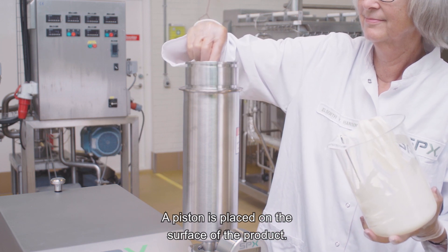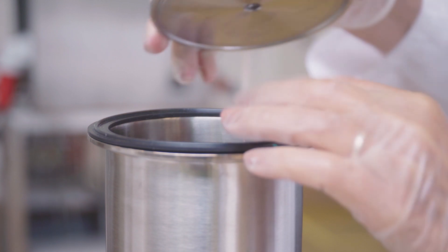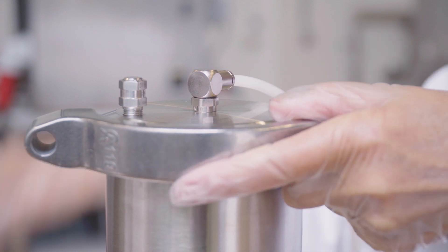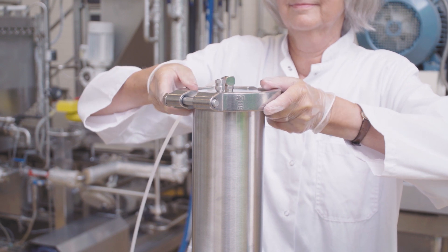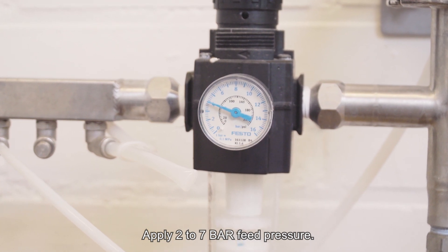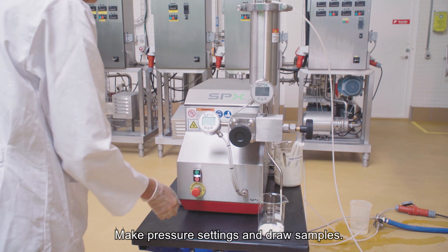A piston is placed on the surface of the product. Apply 2 to 7 bar feed pressure. Make pressure settings and draw samples.